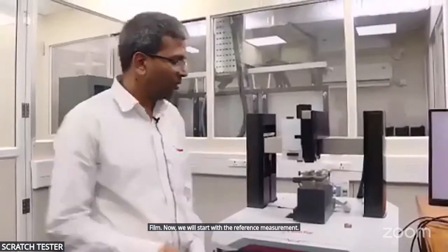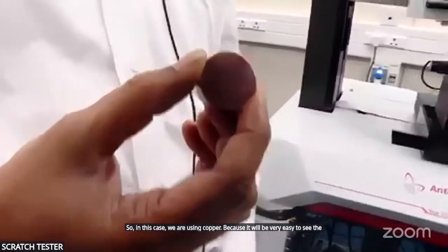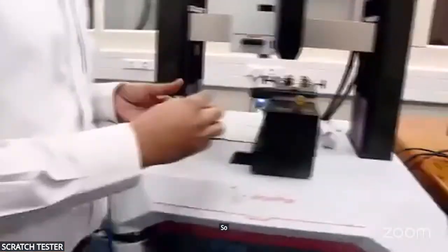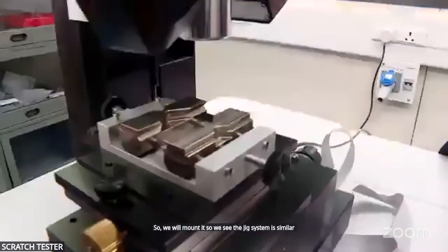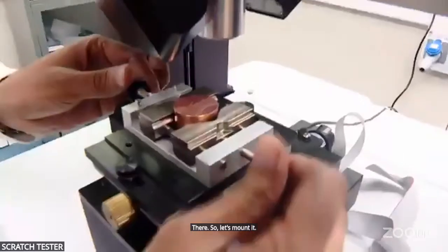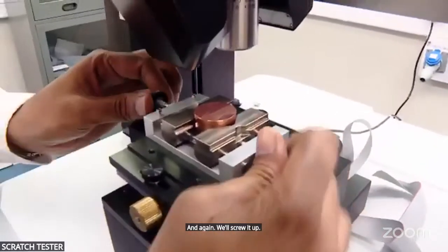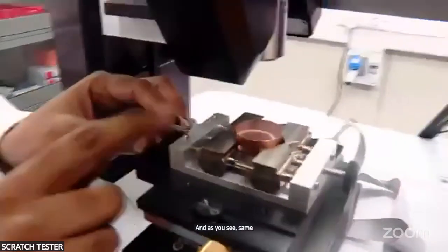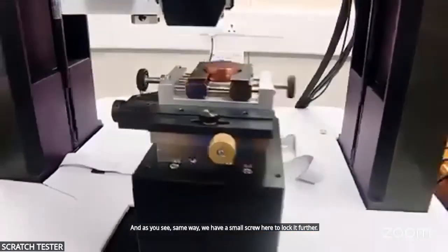Now we will start with the reference measurement. In this case we are using copper because it will be very easy to see the indent. So we will mount it. We will see the jig system is similar to what we have there. So let's mount it and again we will screw it up, and you see in the same way we have a small screw here to lock it further. So our sample is mounted.